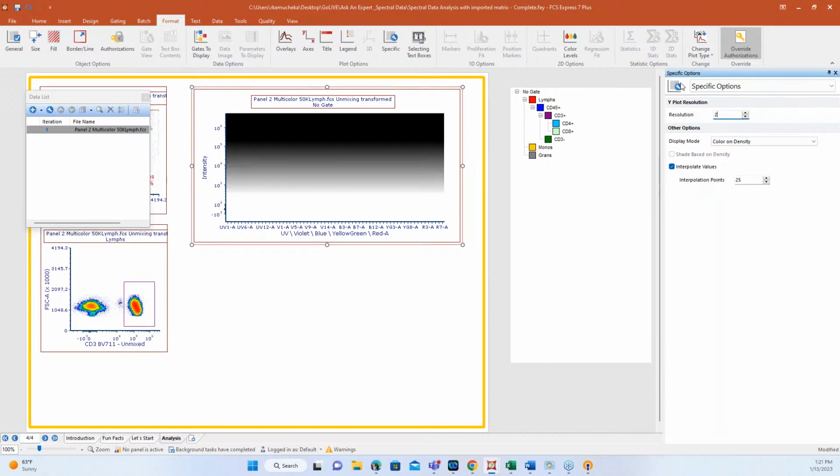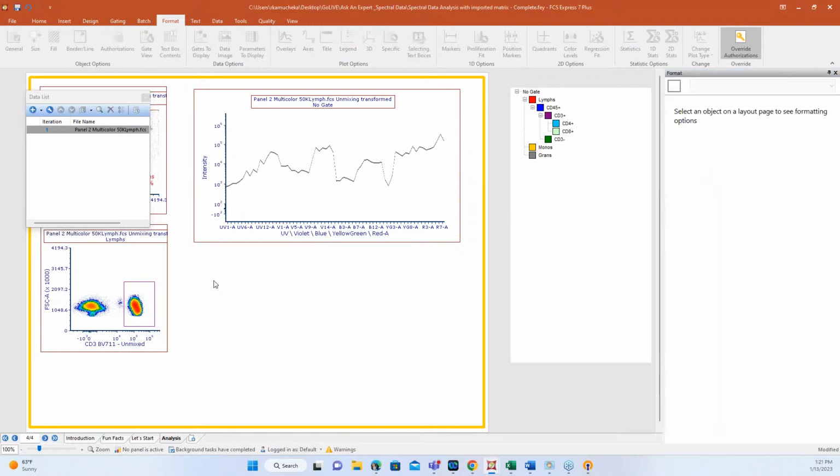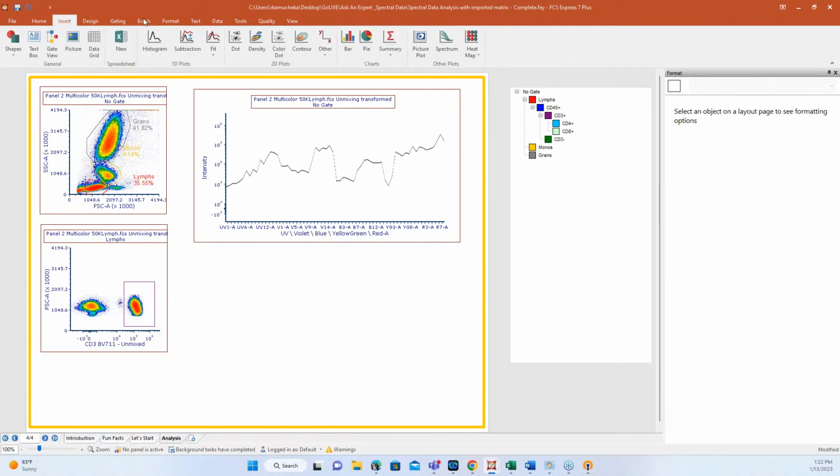And then you can also change this resolution here. So if you wanted to make it more crisp, more clean, you do have the space and opportunity to do that. It's really about figuring out what is going to work best for your data set and what is the best way to display things. We can do nice things like overlays, and also some of the more traditional uses with our data set. You can insert some of our greater tools, or some tools that I really like when you're looking at a bunch of parameters, like heat maps.